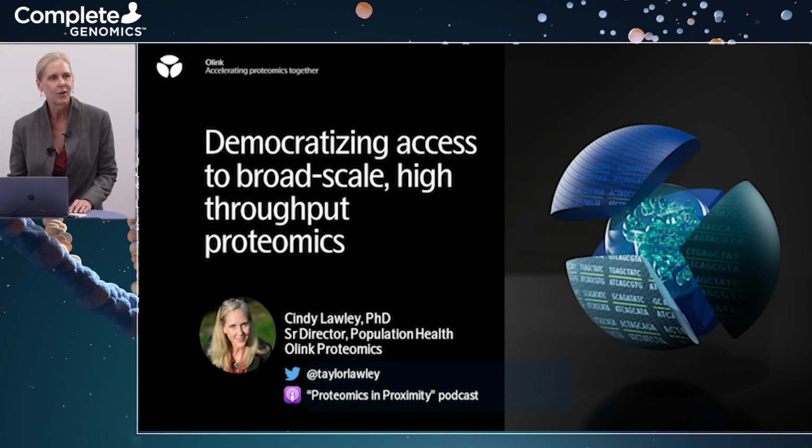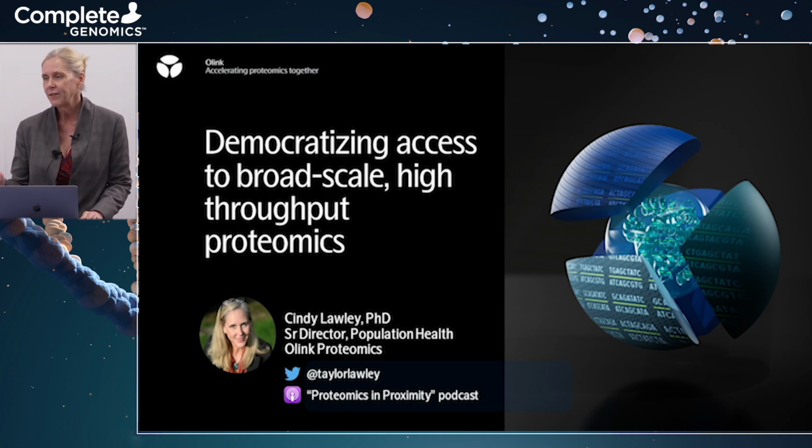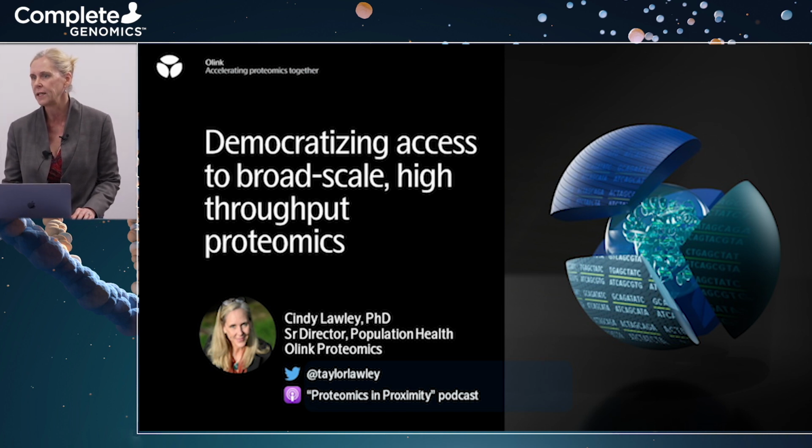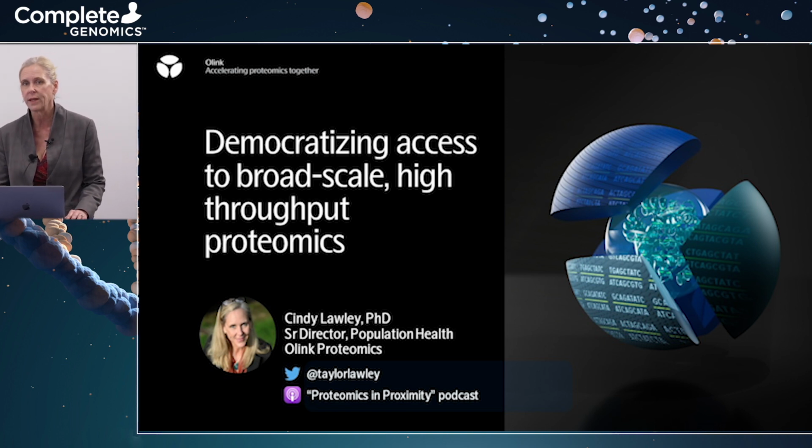Share ways that you can access broad-scale proteomics across the proteome in plasma samples, and anything you can make liquid. So CSF, even isolating exosomes from within plasma. You can analyze the proteomic profile to better understand what these exosomes are carrying within the blood, and in many cases we think this is how signals are going from the blood to the brain, past that blood-brain barrier.